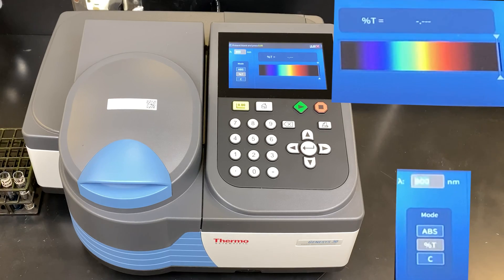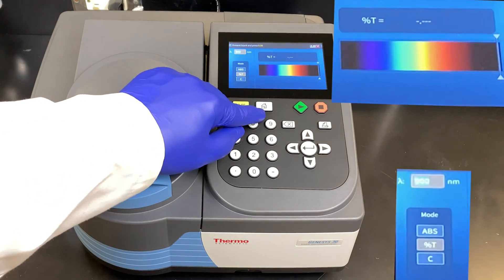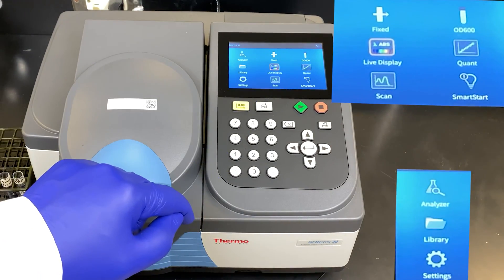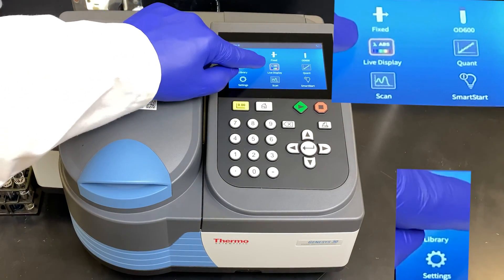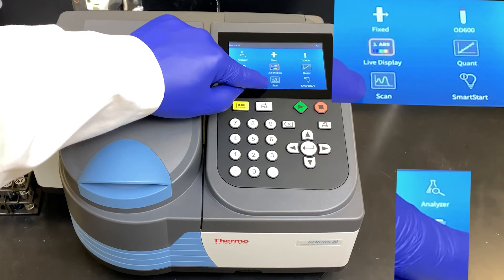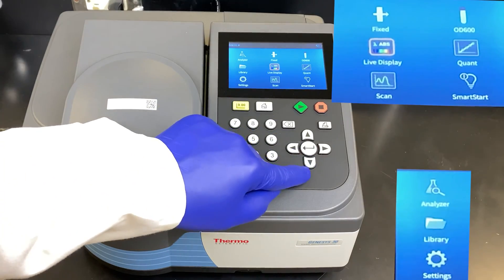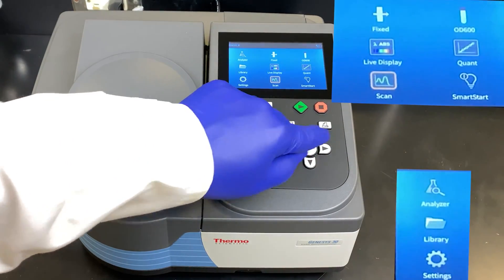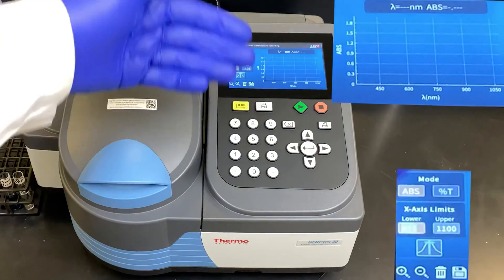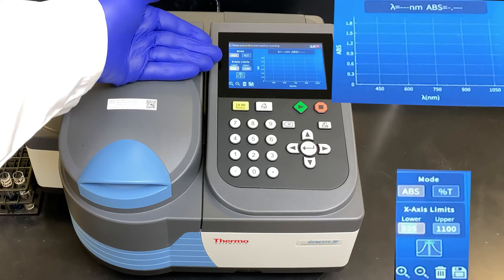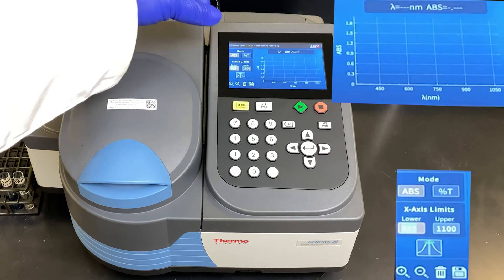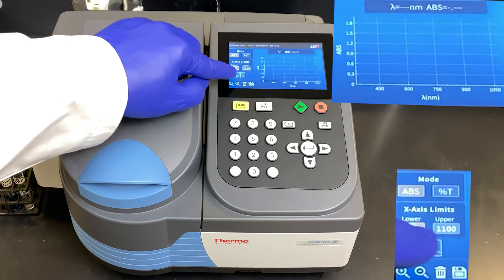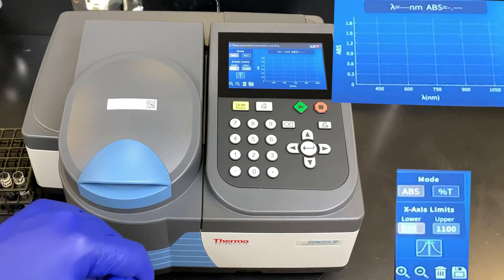Here we have the Genesis 30 spectrophotometer. The home button takes us to the screen where we can switch between modes. We would like the scan mode — cursor down and press the center enter button. Here we can see the screen showing the absorbance, the transmittance, and our lower and upper wavelength limits.